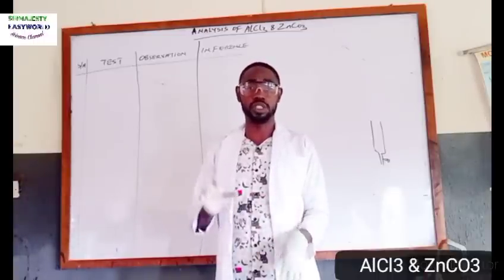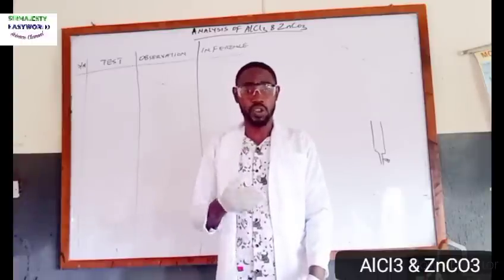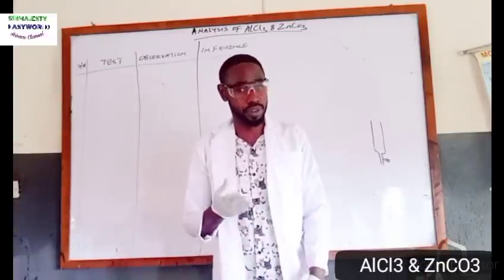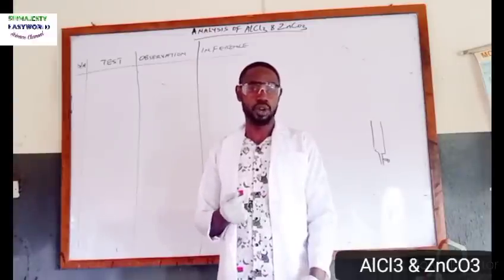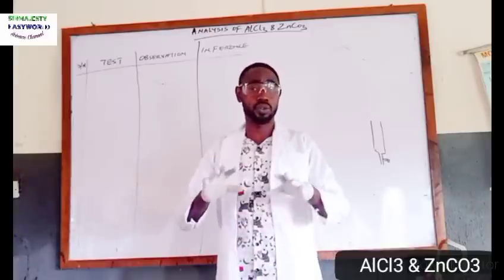Everything in this practical should be demonstrated for you to see. Most of you hear that it turns lime water milky, but you have never experienced where it turns it milky. So the Easy World Science Channel is here to give you the real thing. You will see where it will turn it milky.